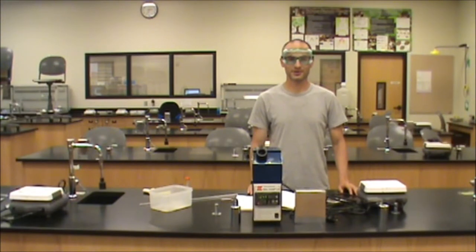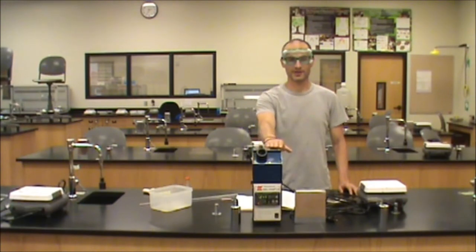Hi, this is Dr. Nick Bucher at North Seattle Community College, and in this video we're going to be discussing use of the melting point apparatus.